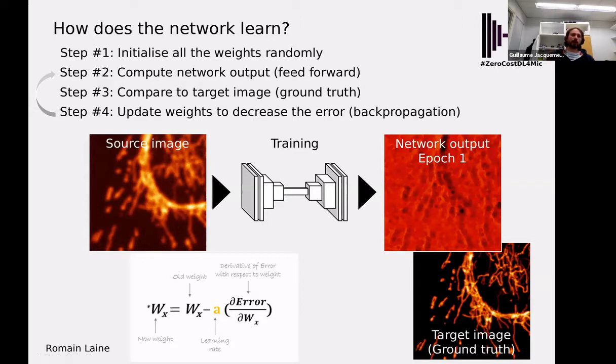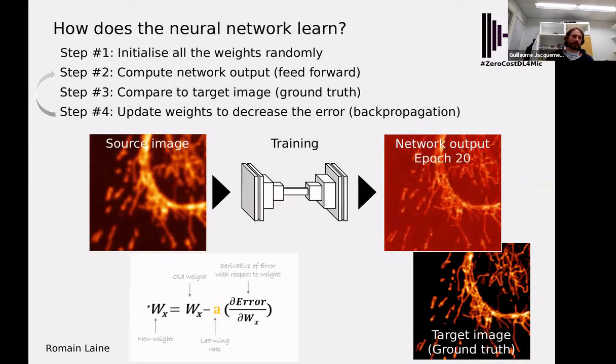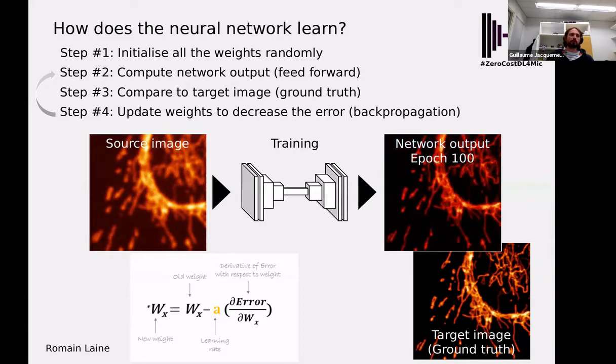And then it's really an iterative process where, by training the network again and going through this process, you can slowly improve the quality of your final images in a way that it matches what you want it to do. So there again, it's highlighting the importance of the training data set that you will use to train the deep learning network, because the network is really learning the task, which is to generate what you want it to generate, based on the training data set.